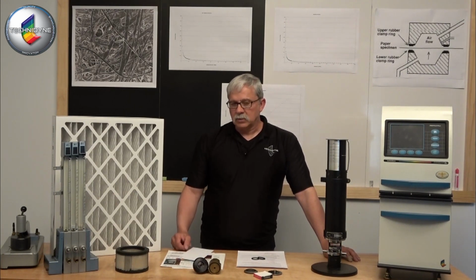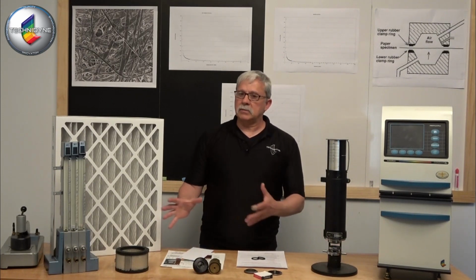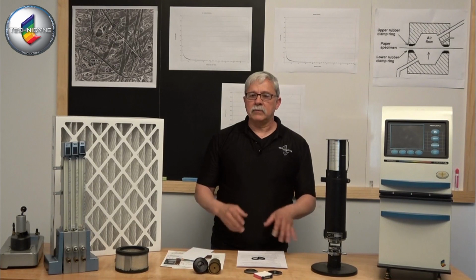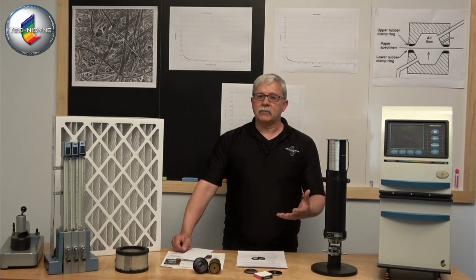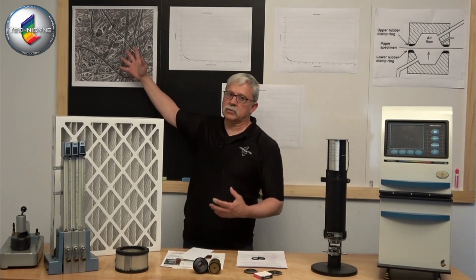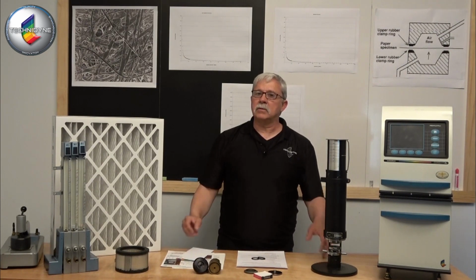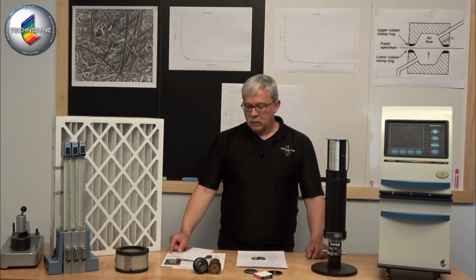All right. So I stated in an earlier video, there's probably no perfect measurement system that's going to work for all the grades that are developed out there today. But you're still going to be able to get some relative indication of how the structure in your product is faring. Is it opening up? Is it tightening up? That type of thing.